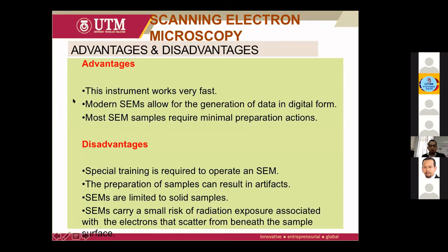Okay, so the advantage of SEM is that it works very fast. The modern SEM allows for the generation of digital files, meaning that you can obtain the micrograph in soft copy, and you only require minimal preparation. But this is also important here. The disadvantage is that SEM is not simply operated by anybody. Those who are less experienced are going to find it difficult to get a high-resolution image. And some samples might have artifacts or defects that don't make sense in your overall sample preparation. And SEM is only limited to solid samples.